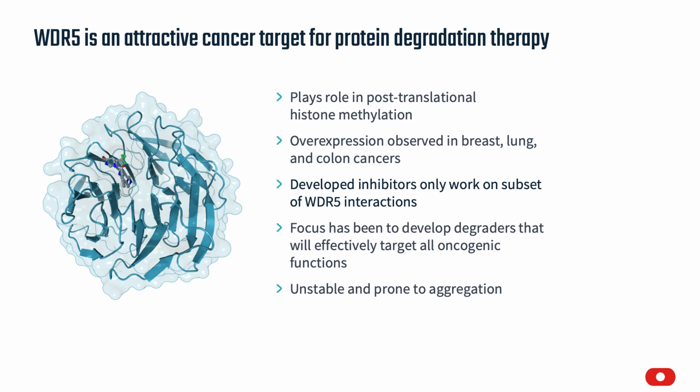In a moment, I will detail their biochemical and structural evaluation of 5 different degraders that target WDR5 via the recruitment of VHL. Using our own biophysical methods, we collaborated with the team at SGC by assessing binary and ternary binding affinities. And then we took this data in the context of the degradation assays that were measured in vivo to understand how the strength of those interactions may be impactful on the degrader efficiency.